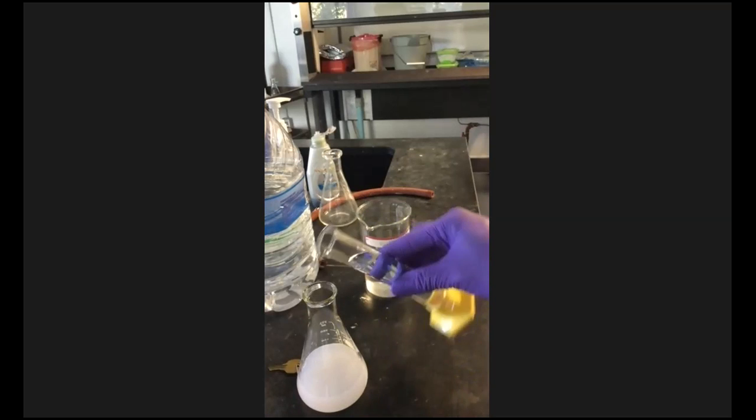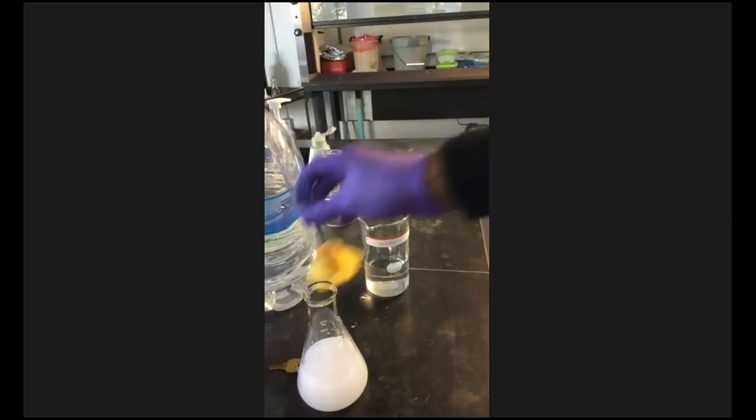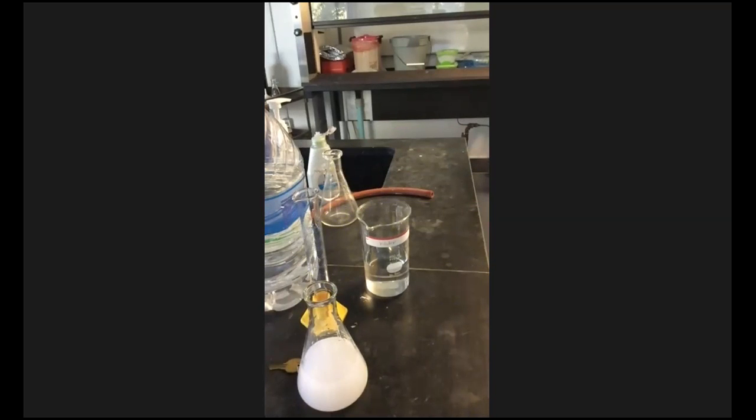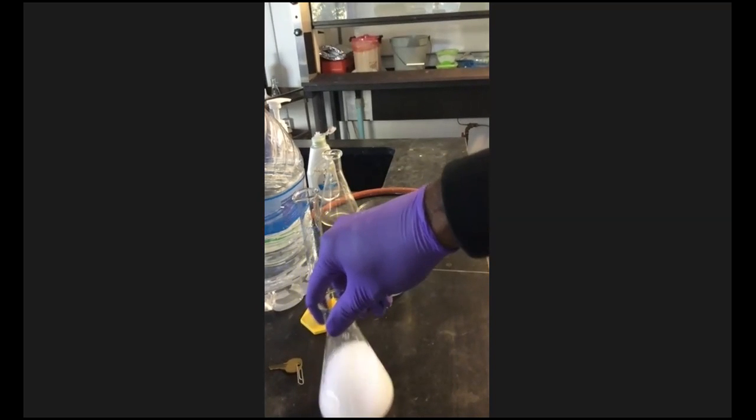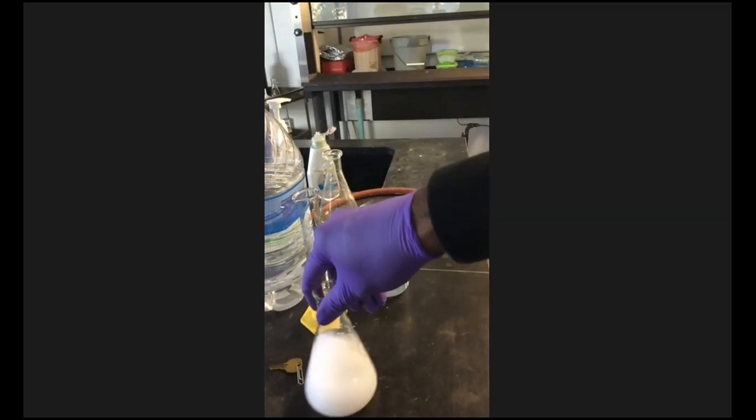Any questions? So I added 150 milliliters of water, and it says to stir for 2 to 3 minutes. I wish I had a stir bar to drop in here, but I don't think I have any up here. So I'm just going to swirl it. Can you put me on a timer? 2 minutes. I'm just going to swirl that around.